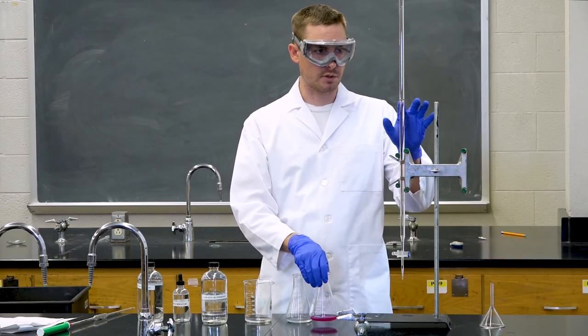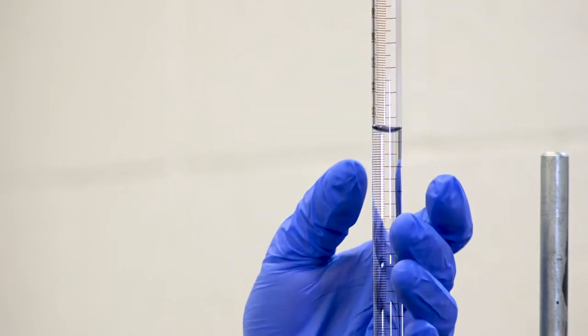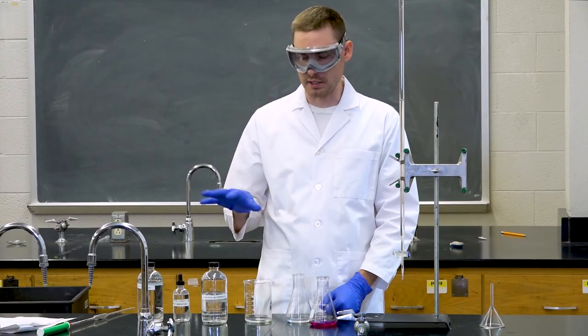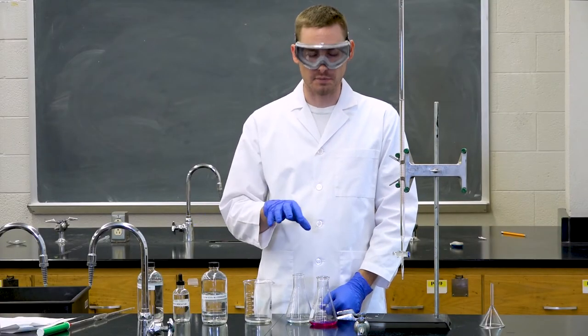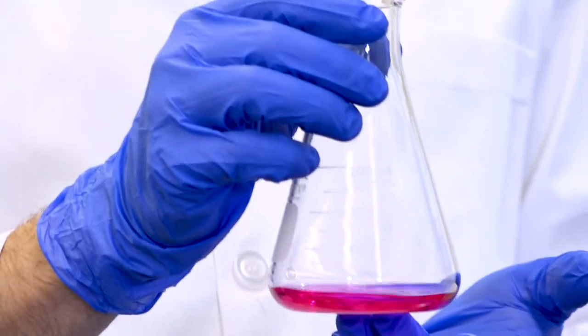So once again, we need to record the final volume on the burette and then subtract the initial volume in order to determine how much volume we have added. We can then use our numbers and the concentrations of our solutions to determine the stoichiometry of this reaction that we have now concluded.